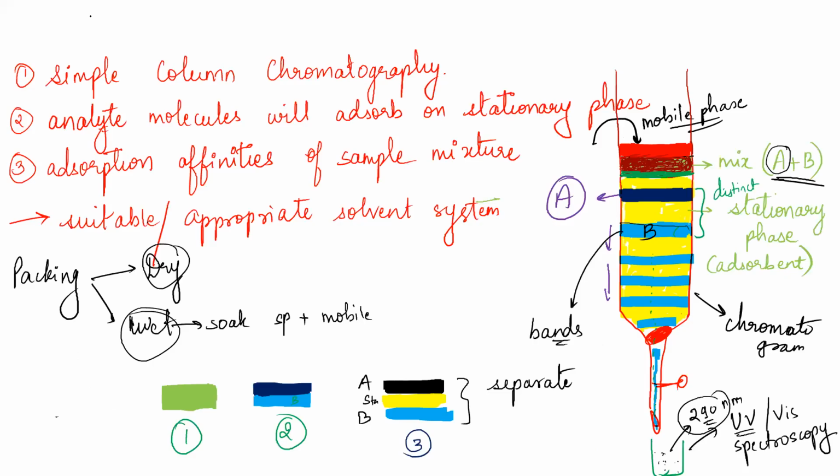So in HPLC, you have a silica column. We saw that we pack a column like this in a laboratory. Now just make it horizontal. If you cut the tip at the bottom and seal it here, and then keep it horizontal or vertical, it becomes a column.